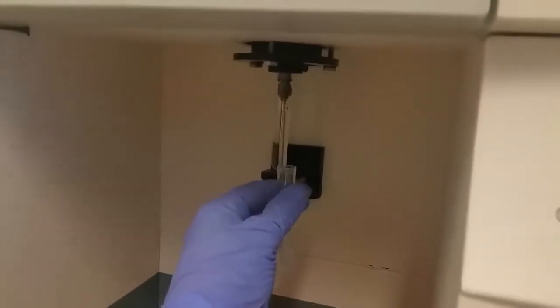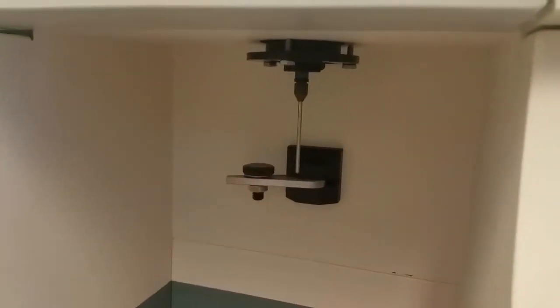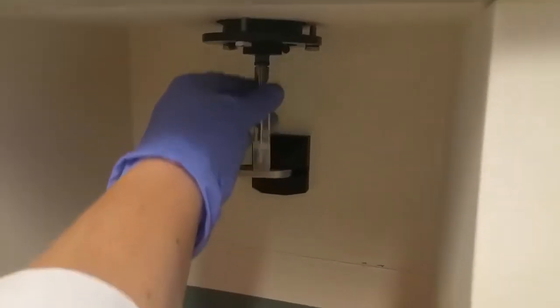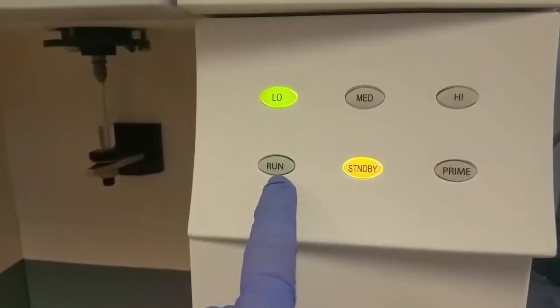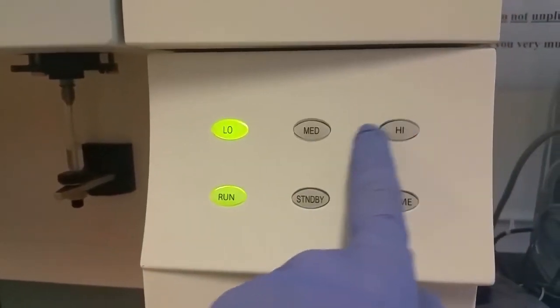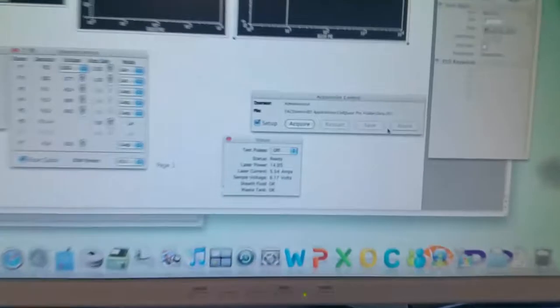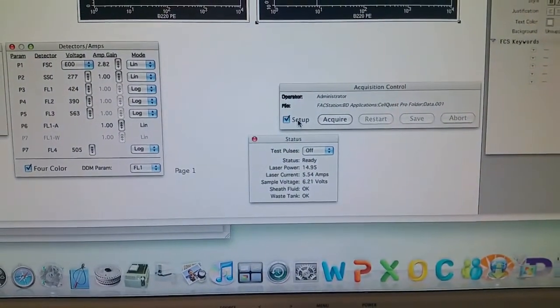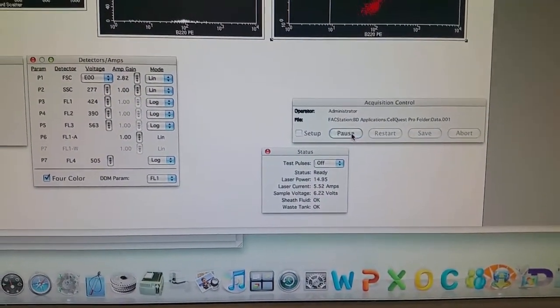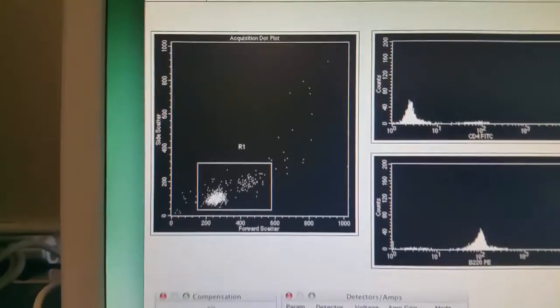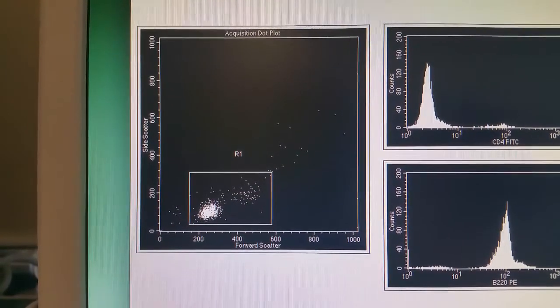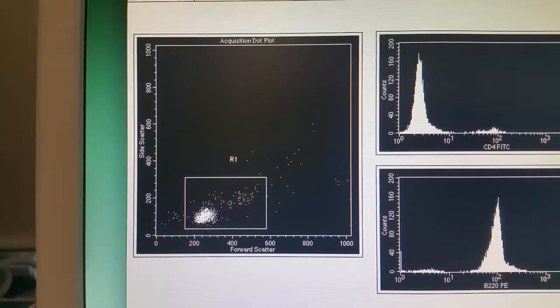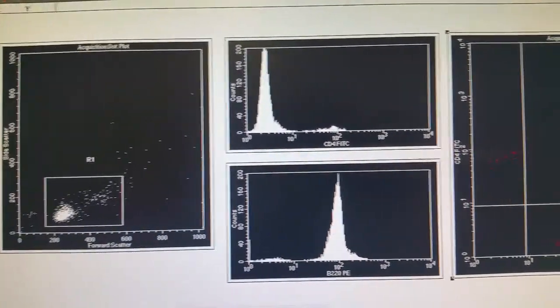Now it's time to put our sample on the machine. Our sample is composed of cells — we have B cells and T cells. We've added antibodies to this sample: the B cells are stained with B220-PE, and the T cells are stained with antibodies against CD4 that are FITC-labeled. We come over to the machine, turn off our setup button, and hit Acquire. As soon as we hit Acquire, the cells start showing up on our screen in real time. 1,000 cells are shown on the screen at a time, and we can see them appear individually as they pass by the laser.